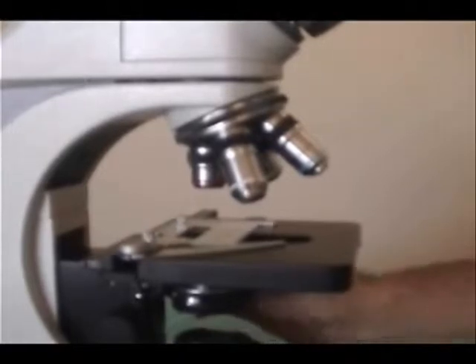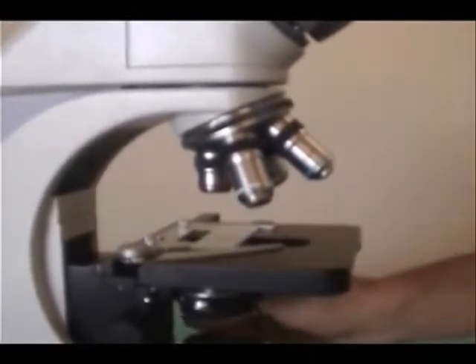What we see here on the stage is 140 millimeters by 140 millimeters. Now, the stage goes up and down and side to side. So you can better view the specimen depending on what you're looking for.